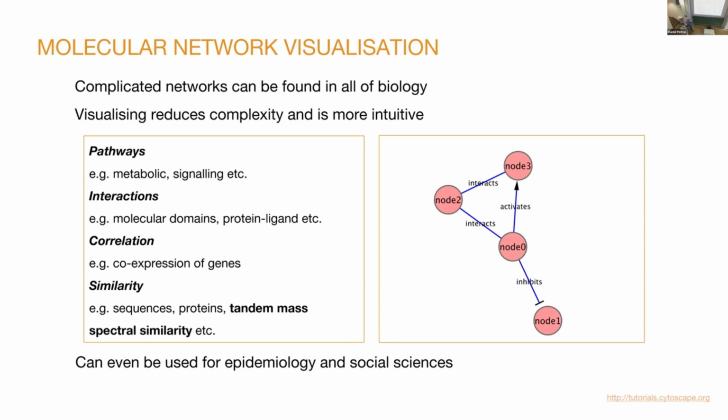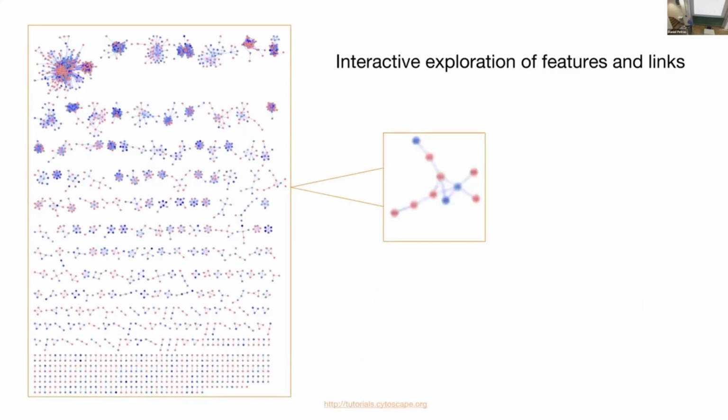So this is something you can nicely do in Cytoscape as well. So there are really a lot of opportunities, and what we do here is really just the very, very basic. Okay, and then what we want to end up with is basically something like this, a global molecular network, and then we can zoom in and explore this molecular space.